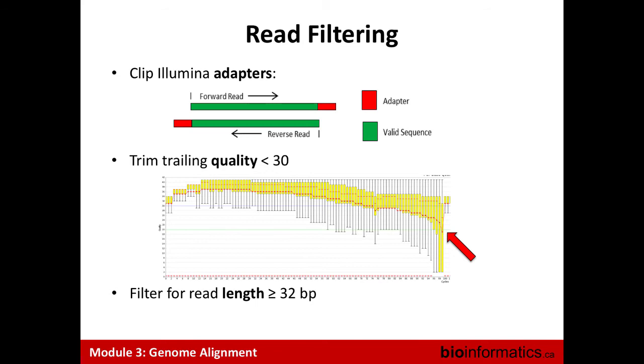But as I said, when you work on NGS and when you analyze and process your data, there's one common thing you need to understand: every time you do something, you make a choice. And you have to pay for this choice. So it's why I'm really focusing on that, to make you understand all the concepts behind the analysis, because when you do your analysis, you will have to make some choices, and you will have to understand what the consequence is.